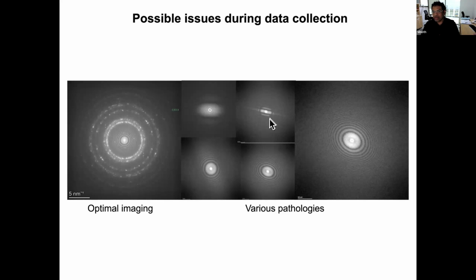And here you have a drift. This can happen when you forget that you have to turn off your turbo pump after changing the grid. This can happen easily, in particular if you are sitting in a different room and setting up data collection not in the same room as the microscope, so you may not hear the pump running.